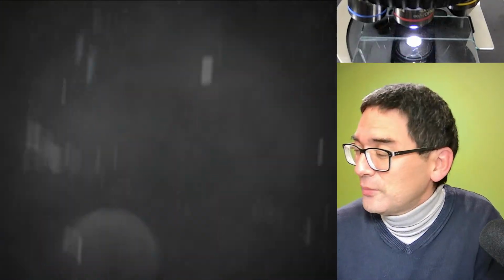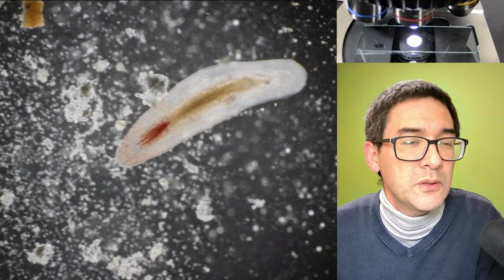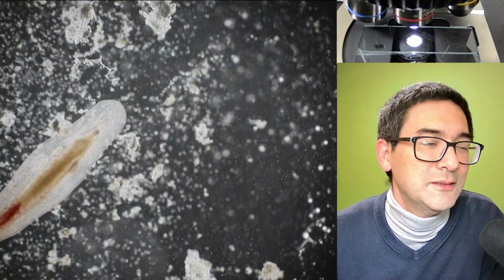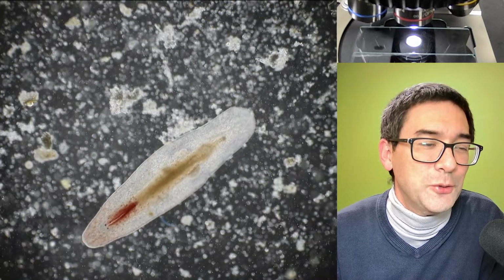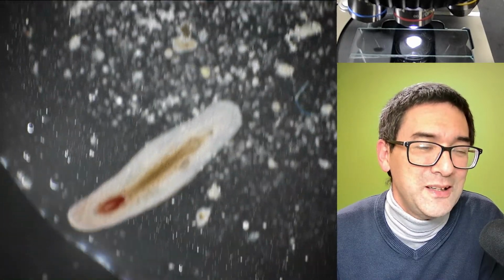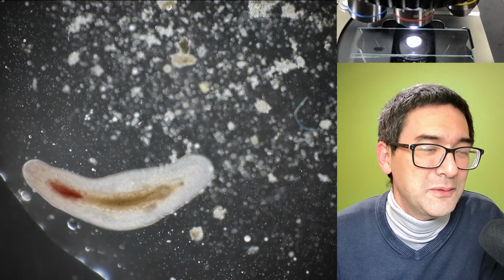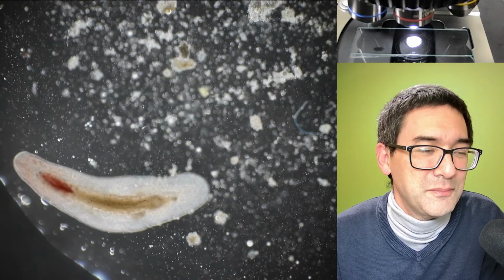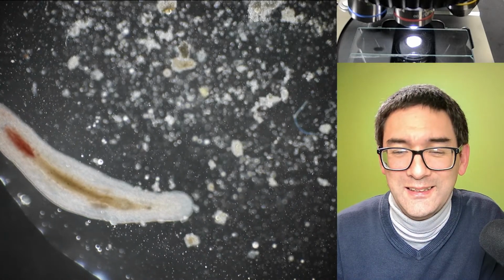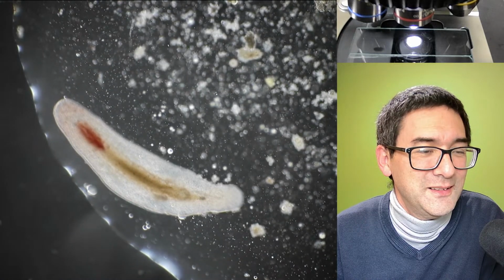So this is the one. Let's see how the other one. Where's the worm? Here it is, the flatworm. That's the flatworm now in dark field. Doesn't seem to mind at all. And all of those dots in the background are actually pieces of the cracker, of the chip. Doesn't seem to mind at all.